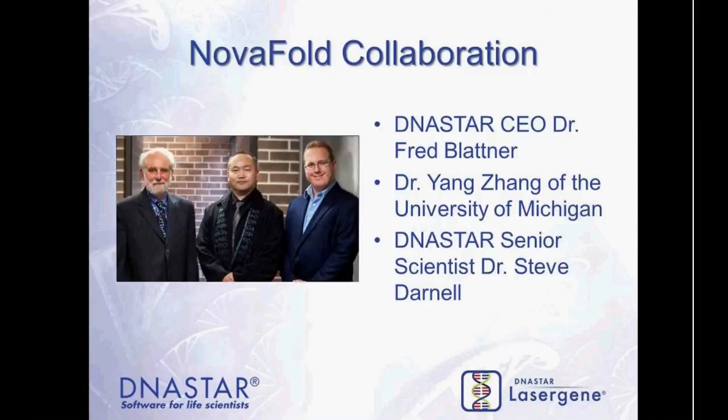Now, this NovaFold application was born out of an ongoing collaboration with Dr. Zhang of the University of Michigan. NovaFold utilizes the Zhang Lab's I-TASSER algorithm to build accurate, full 3D atomic models of proteins with previously unknown structures.